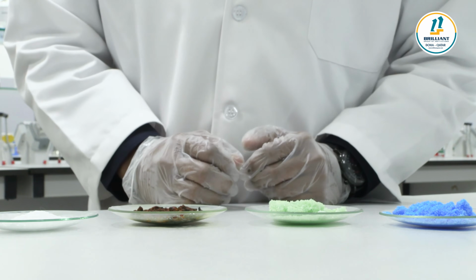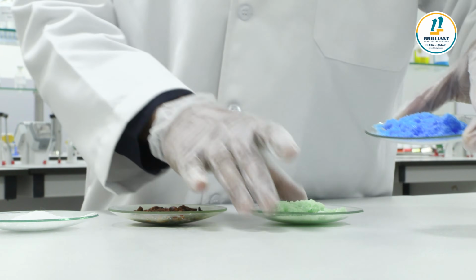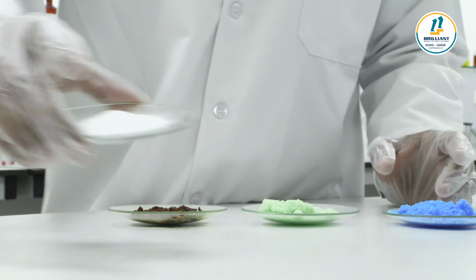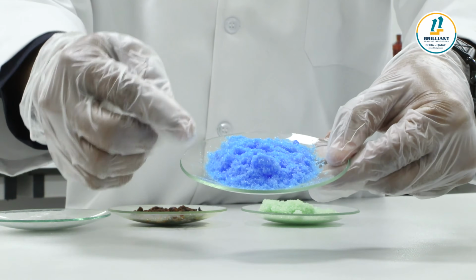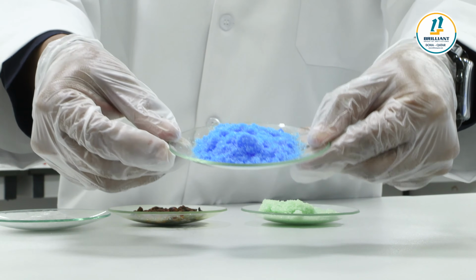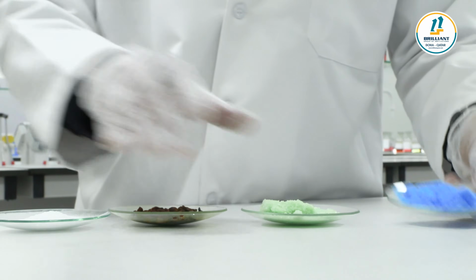There are different kinds of salts that can be provided. You can see that these are colored salts, and there is a colorless salt. For example, this salt is blue in color, which indicates that it may be a copper salt. It can contain Cu2+, copper. Copper salts are generally blue in color.